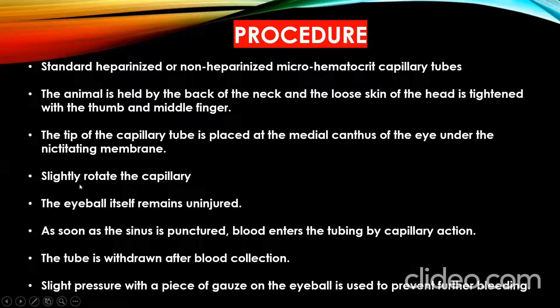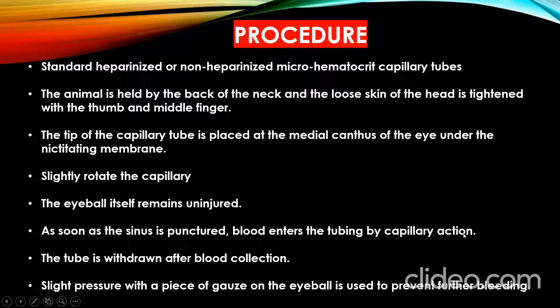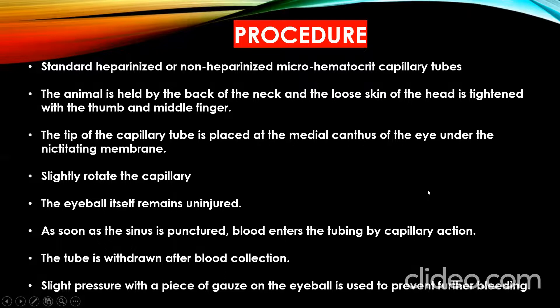The capillary is slightly rotated. Care must be taken that the eyeball itself remains uninjured. As soon as the sinus is punctured, the blood enters the tubing by capillary action and the blood can be collected. The tube is withdrawn after sufficient amount of blood is collected. Then slight pressure with a piece of gauze on the eyeball is used to prevent further bleeding from the eye.